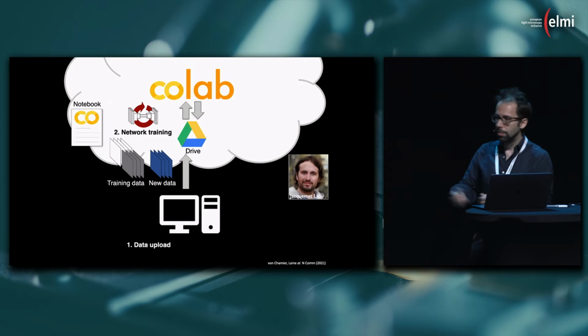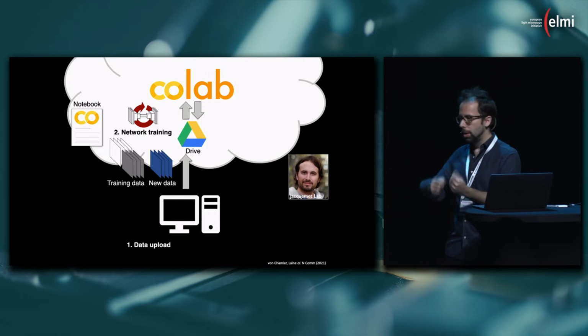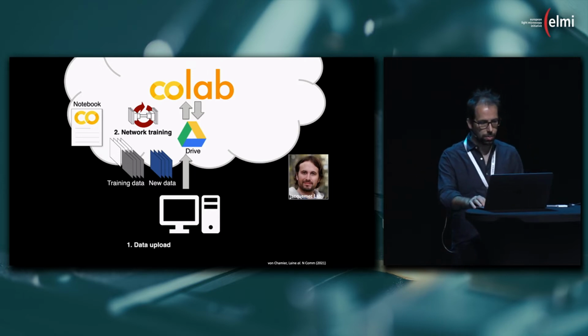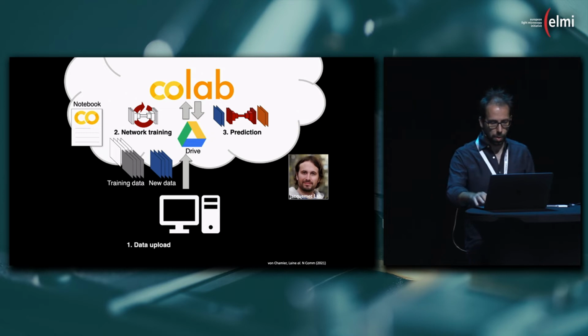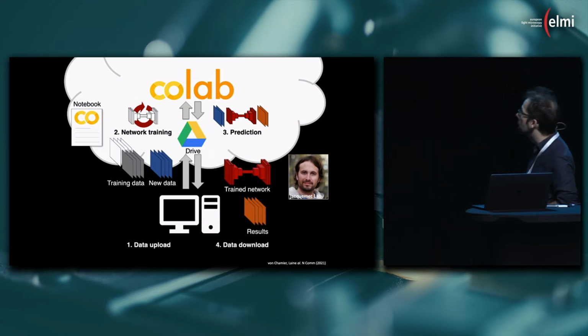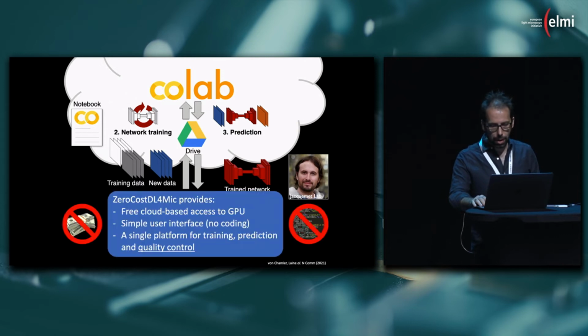So you can immediately start the computer, grab data, and try it out, learn how to use machine learning, and learn how to use some of the tasks we have implemented. So you get network training, prediction, and then you can obviously pull the data back out of it. So what can you do with this?